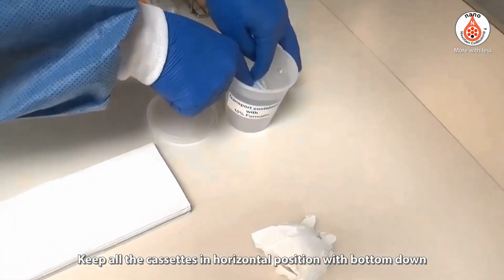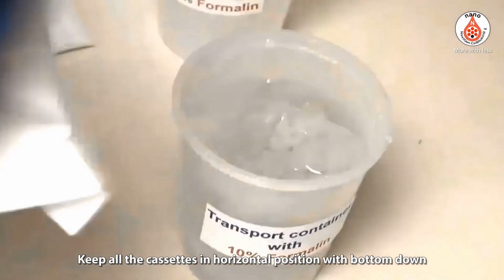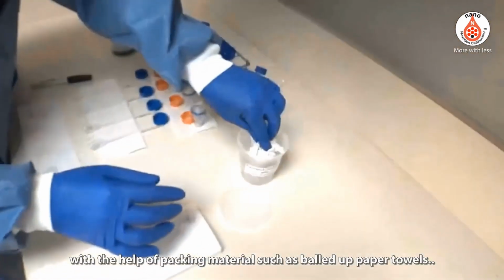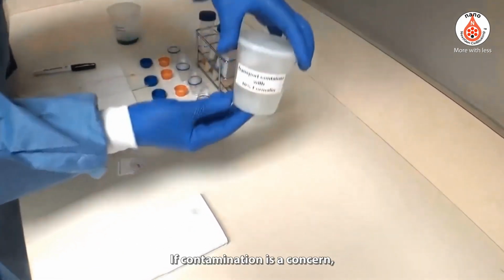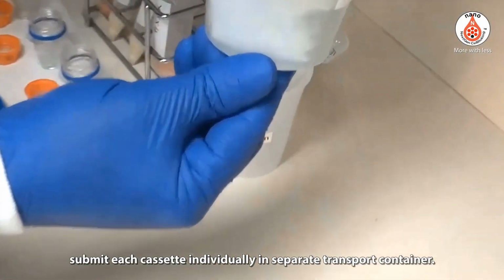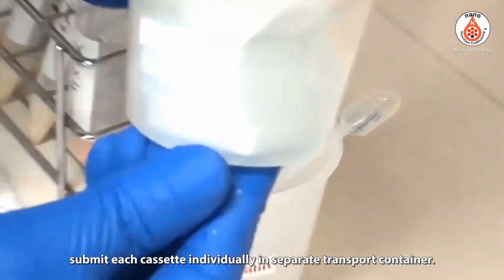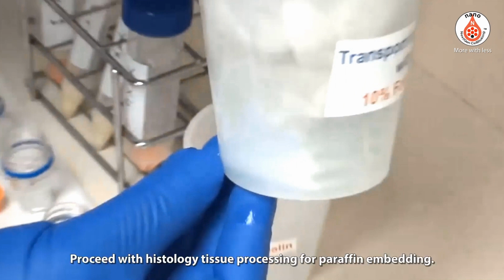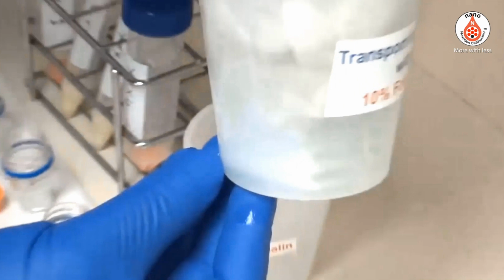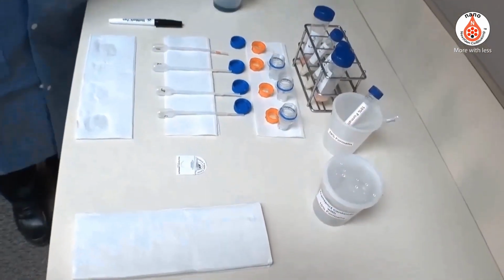Keep all the cassettes in a horizontal position, with the bottom down, with the help of packing material, such as balled-up paper towels. If contamination is a concern, submit each cassette individually, in a separate transport container. Fix for more than 2 hours, or for the time set by your laboratory protocol. Proceed with histology tissue processing for paraffin embedding. Discard all used material.